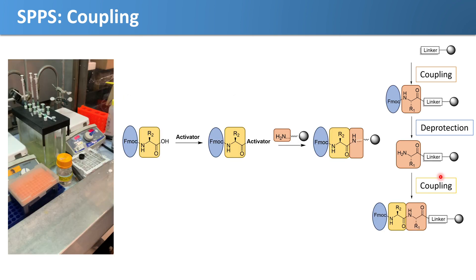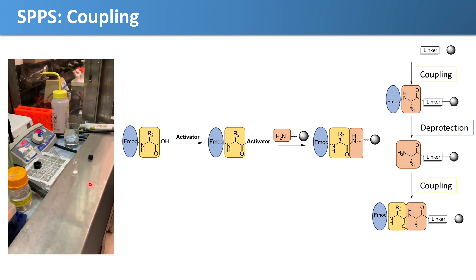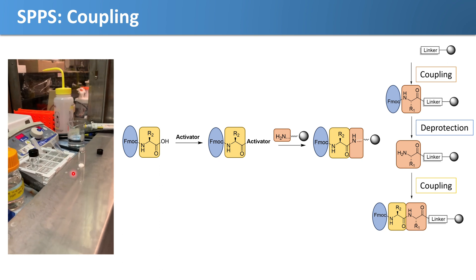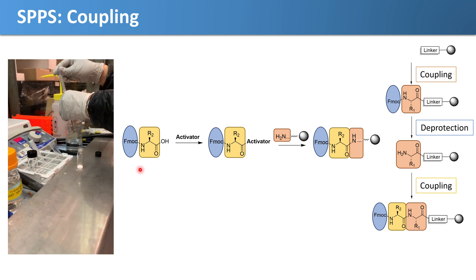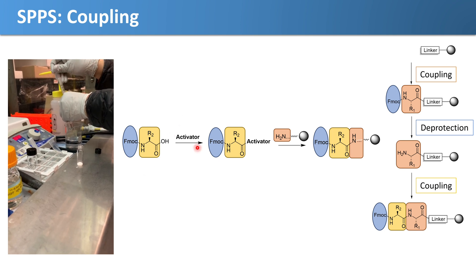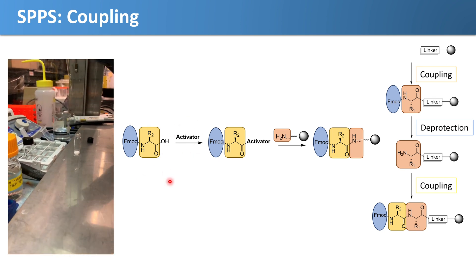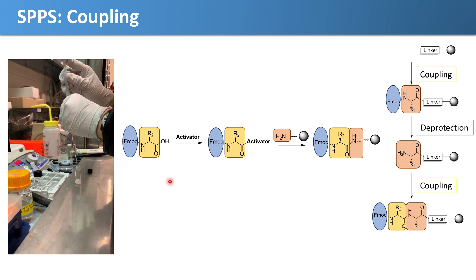After the deprotection is performed, our next reaction is a coupling again. But this one's a little different because our next amino acid is not reactive enough to just couple on here, so what you have to do is you have to activate it first. In this vial here, Huangine has our amino acid, our next amino acid, weighed out in a vial with the activator. Here she's adding DMF and she's going to dissolve the two.